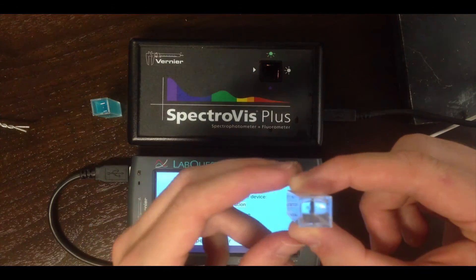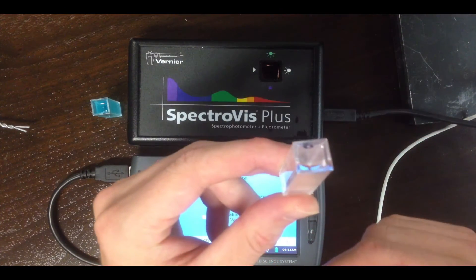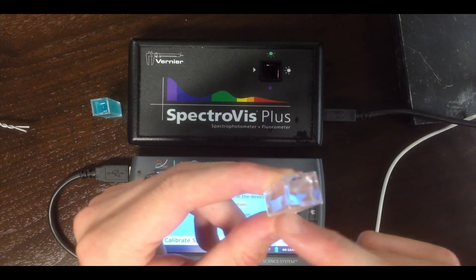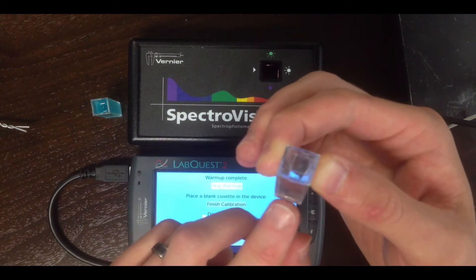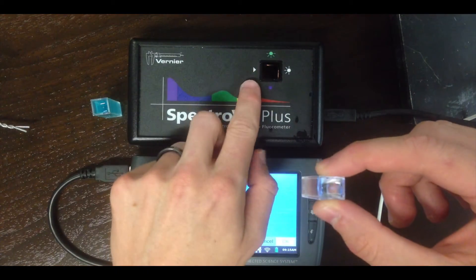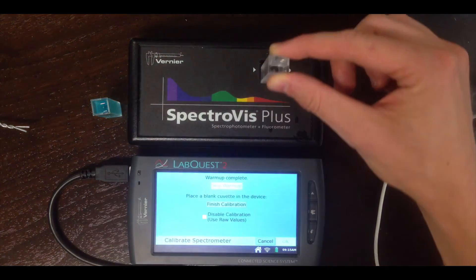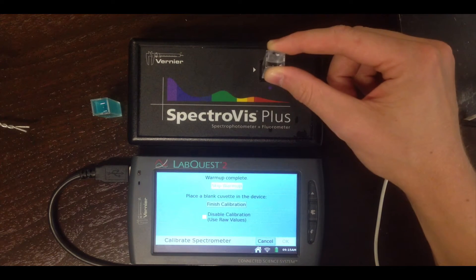It's called a cuvette, and there are some important things to notice about how a cuvette is put together and how it goes into the spectrometer. If you look at the sides of the cuvette, you'll notice that two opposite sides are kind of ribbed — they have grooves — and the other two sides are smooth and completely transparent. You want to make sure the transparent side is facing the direction of the light beam. The spectrometer makes this easy: a white arrow and the white light both indicate the path of the light source.